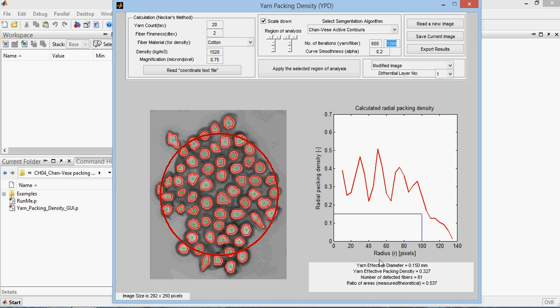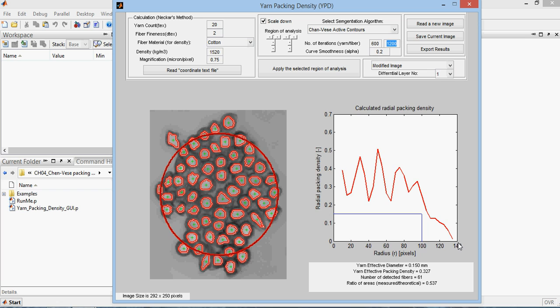This is the final results, and this is a graphical representation of the fiber distribution across the radius of the yarn. From zero at the center of the yarn to the outside diameter, or radius in this situation, we are talking about the radius here expressed in pixels.